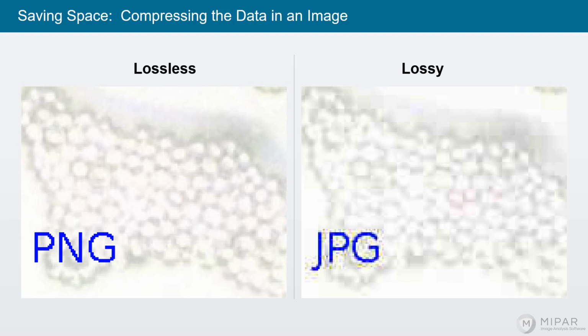And another note, you can't take this image and save it as a PNG and expect to get that data back. It's gone forever. If you were to convert this image back to a PNG file, you would get a perfect copy of a ruined image. So have fun with that.